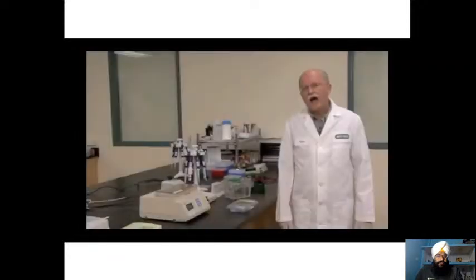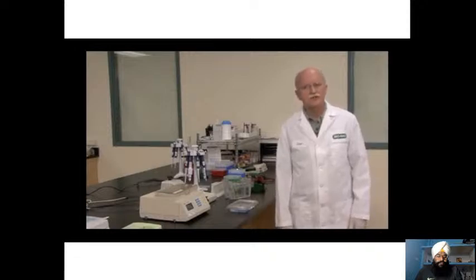Here you can see that I have generated a gel with a clear background and well-resolved spots. I have now completed the entire process for running a 2D gel. I hope that the techniques and tips will help you when you run your next 2D gel.